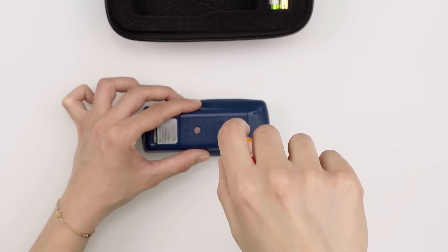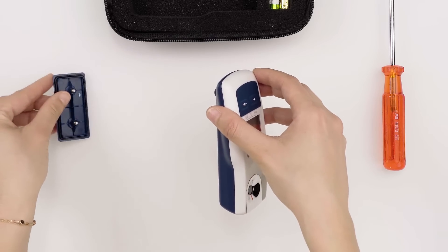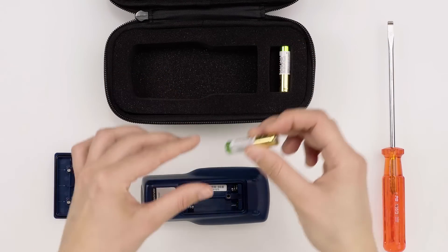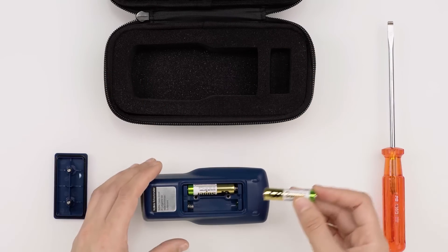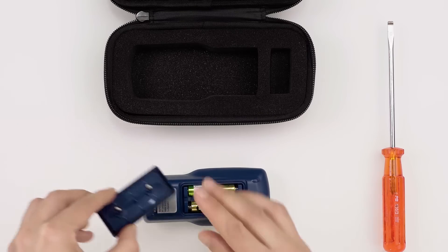Insert the two alkaline batteries in the correct position. Close back the battery compartment by turning the retaining screws in a clockwise direction.